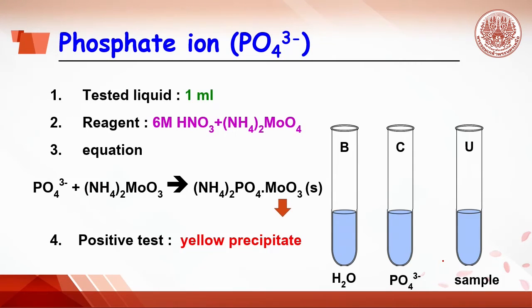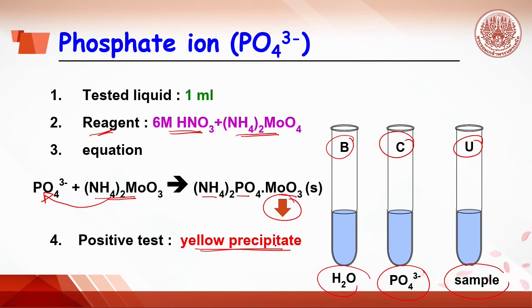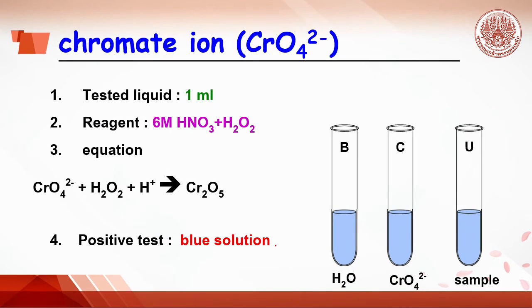In the case of phosphate ion testing, do the same by adding water, phosphate ion and sample in the B tube, C tube and U tube. Then add the reagent by adding nitric acid, followed by ammonium molybdate. Once ammonium molybdate is added, it will react with phosphate ion to get the precipitate of ammonium phosphomolybdate, which is yellow precipitate. In the C tube, we will see yellow precipitate. If in the C tube it cannot be seen, dip the tube into the hot bath.